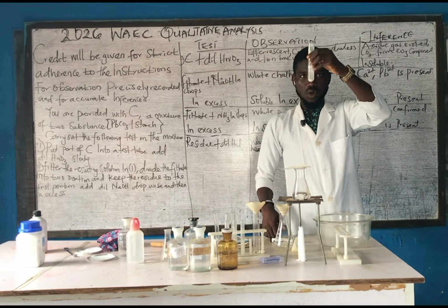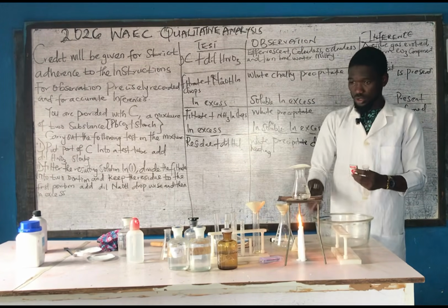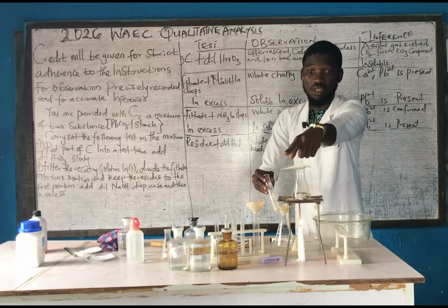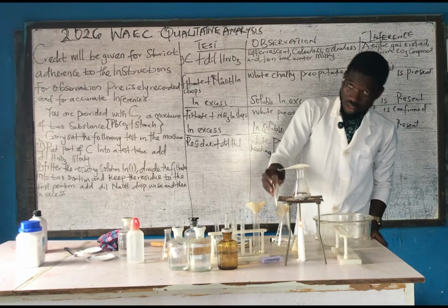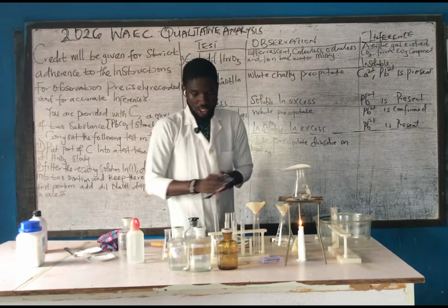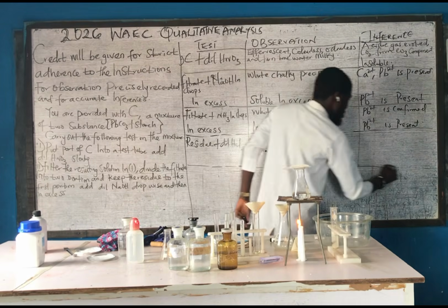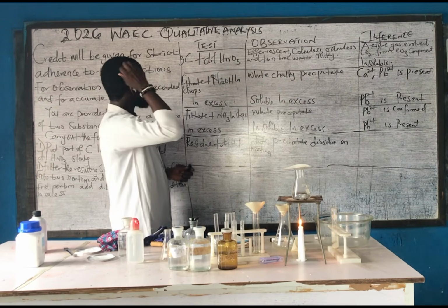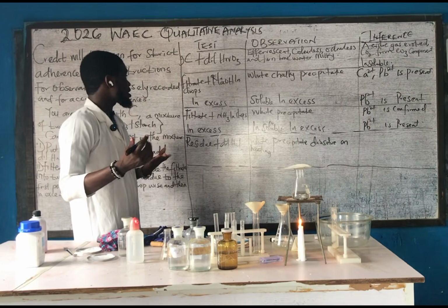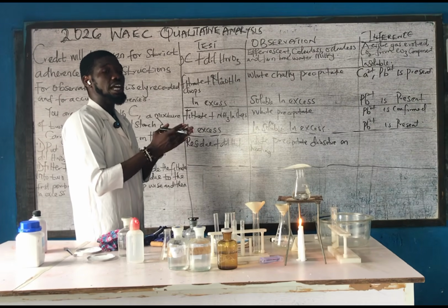Let's see. Wow. Okay, you can see we have some particles beneath. Please pick that duster for me there. So let's leave this to warm. Now for this residue plus HCl, if you observe vividly, based on what they asked us to do, HNO3 is one of the reagents being presented among what are given to the school.